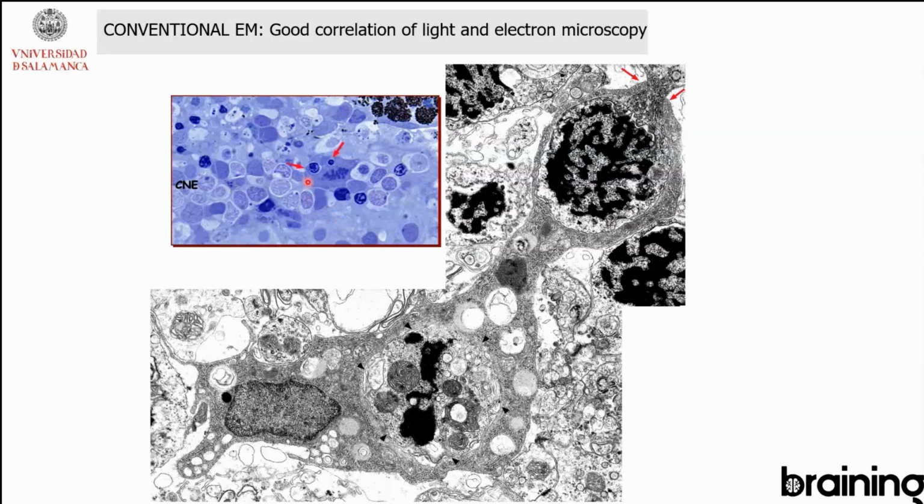This is like a check in light microscopy that you can have just to correlate with what you have in the electron microscope. For example, here is a microglial cell which is actually engulfing some of the cells which are dying in a retina that I did some damage on.